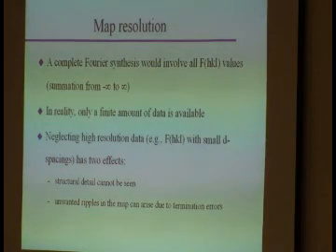The important thing is they should be small. And they are given in electrons per cubic angstrom. If you have something that is minus 10 electrons per cubic angstrom, probably not good, okay? Maybe you assigned a wrong atom in that position. Maybe you assigned an atom where there is none, but something isn't right.